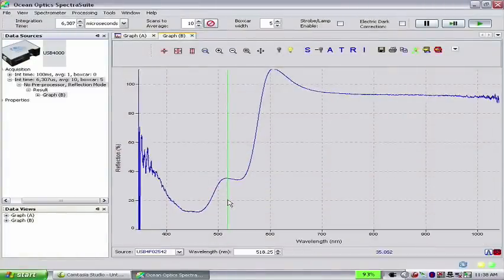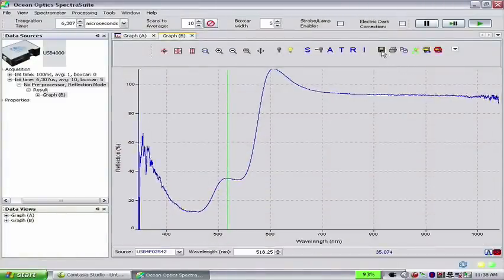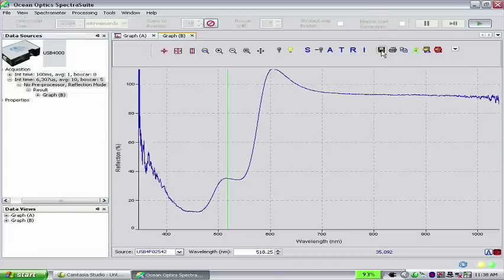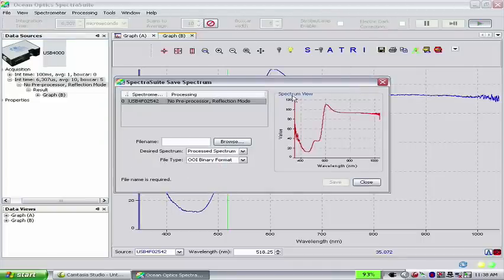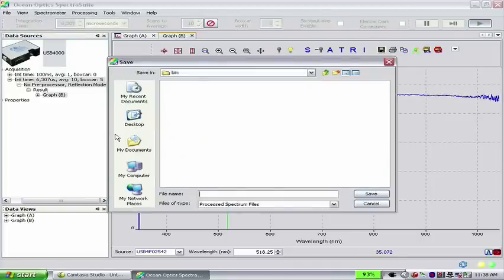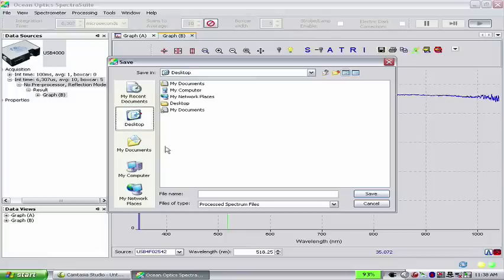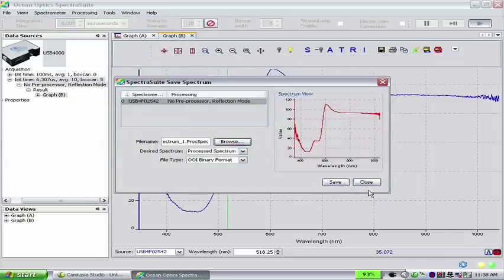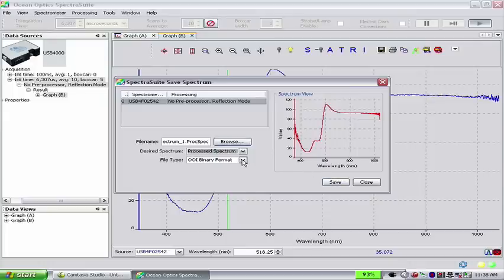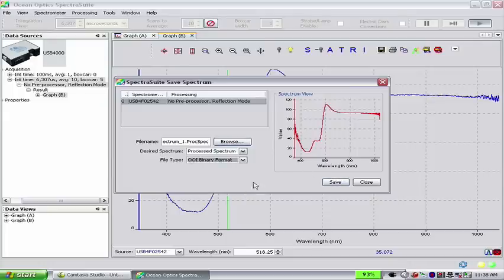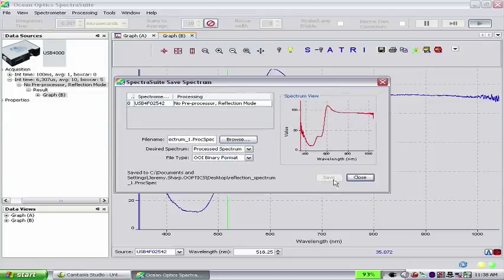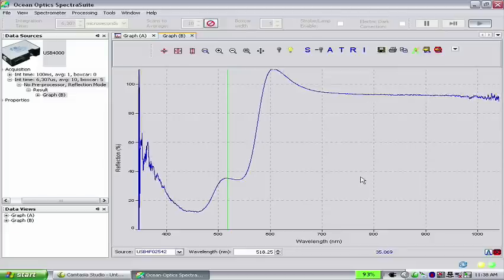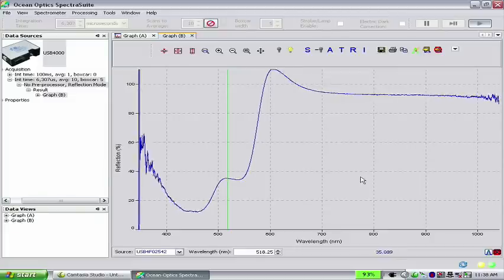To save this reflection spectrum, simply click Save Spectrum. Browse to a location where you would like to save the file. Give the file a desired name and click Save. Select the file type you wish to save, click Save, and then click Close. The spectrum is now saved in the directory you specified.